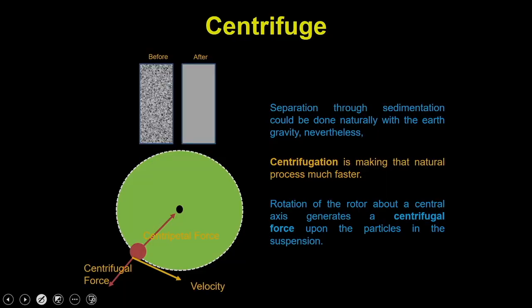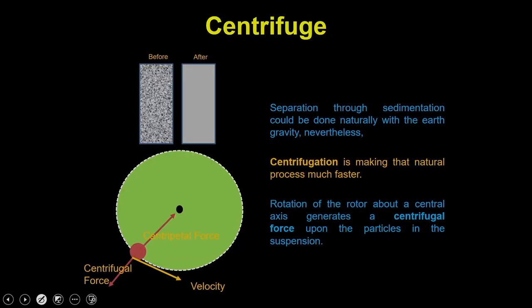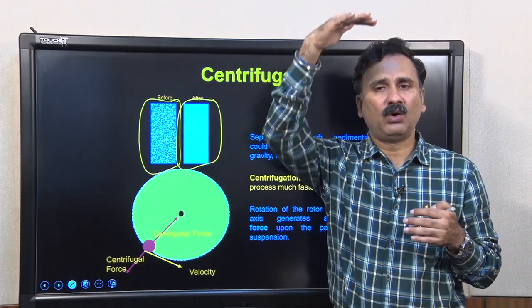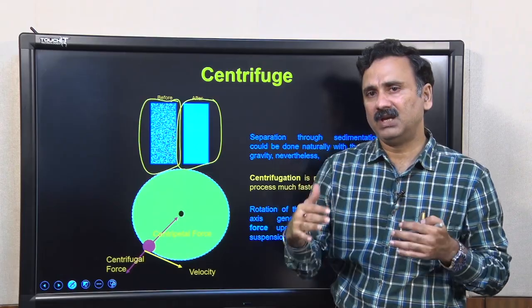Sedimentation is nothing but the settling of the material. If I take a little mud, put it into water and mix it, and then allow it to settle down, the mud will settle and the water is going to be cleared. This process of settling of the heavier particles in the liquid is called sedimentation.